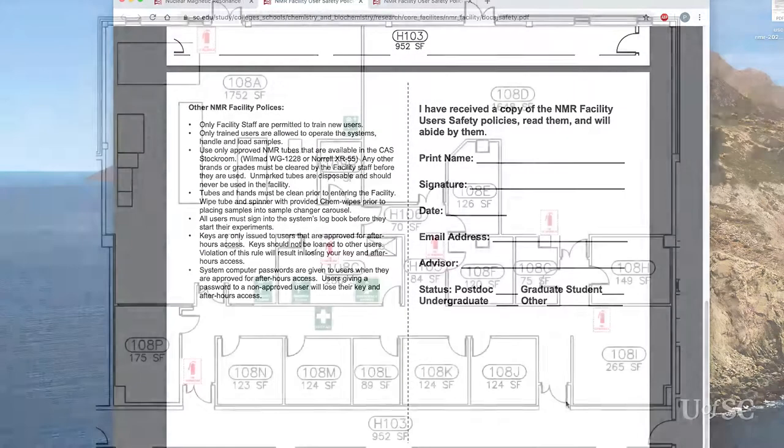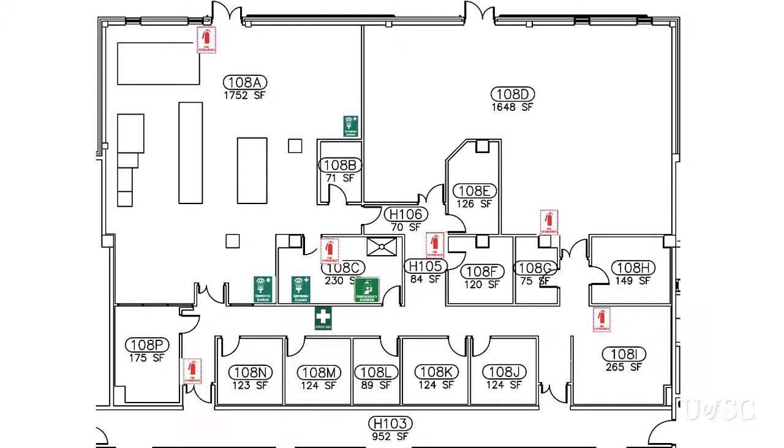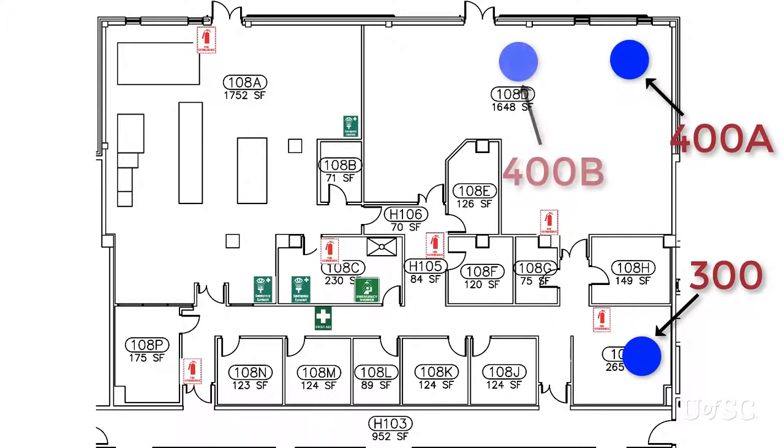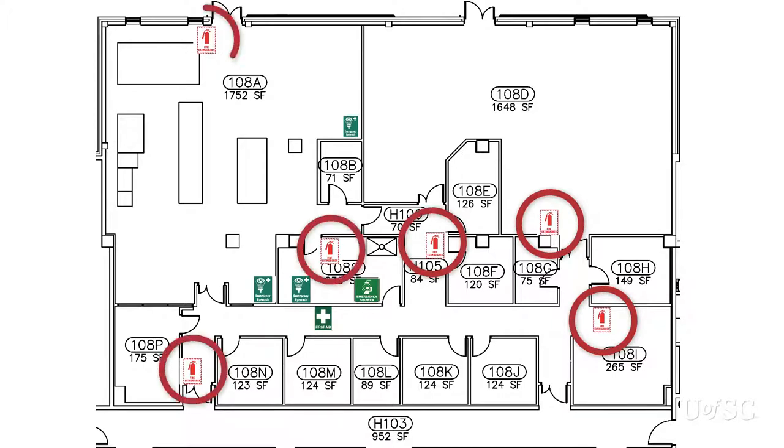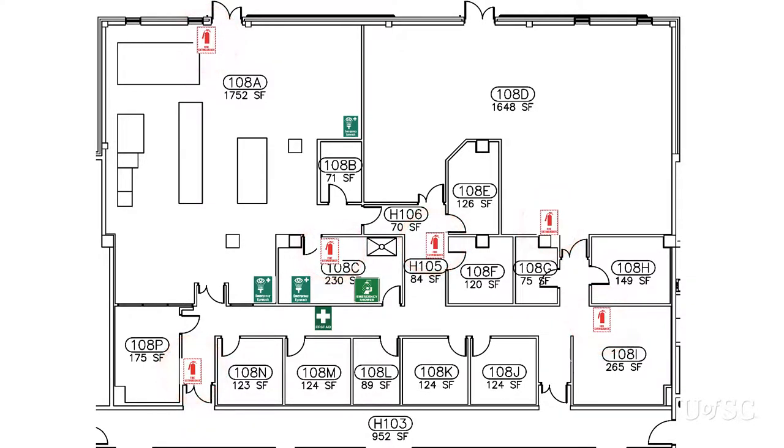Download and read the safety document prior to training. There is a consent form on the last page that you must sign and return during the training session. You need to be familiar with the lab setup and where you can find important safety equipment. The 300 is located in room 108 I. Your primary emergency exit should be the same door you entered; however, should it be impossible to use this exit, there is an additional emergency exit in the back of the main lab in 108 D. Fire extinguishers are mounted by most doorways in the facility including the 300 lab. There is an emergency shower in the wet lab, room 108 C. Eye wash stations are located by the sinks in the wet lab and in the mass spec facility room, 108 A.